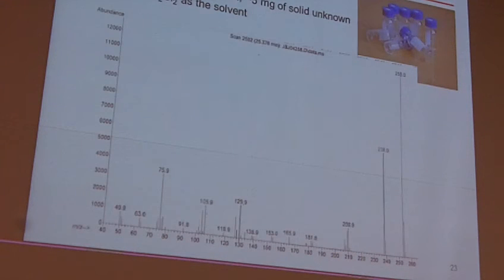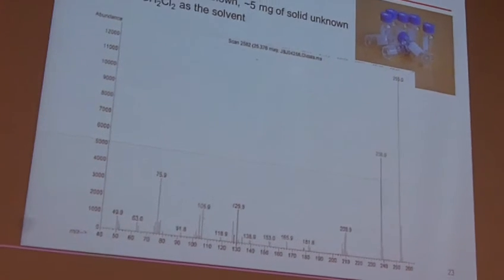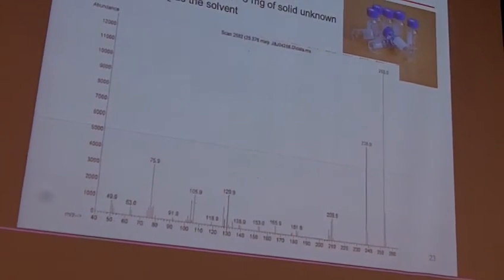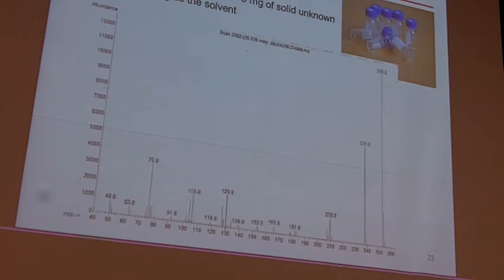All right, the second piece of information you get from the GCMS is the MS side of it, and that's going to be a mass spectrum that looks something like this. So look back in your notes from chapter 12 of last semester. That peak that's farthest down to the right will most likely be your molecular ion peak, so that's going to tell you what the mass of your compound is. You'll also be able to get some fragments out of there, so you can use that data to get some information as to what the structure of your compound looks like.